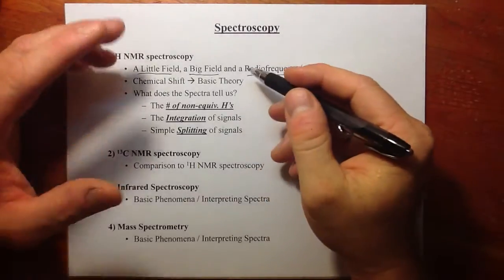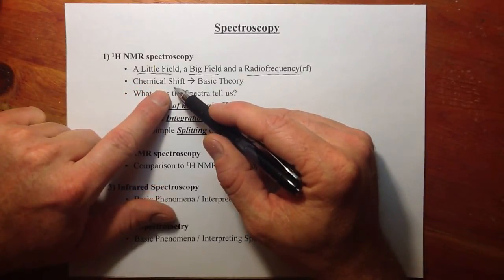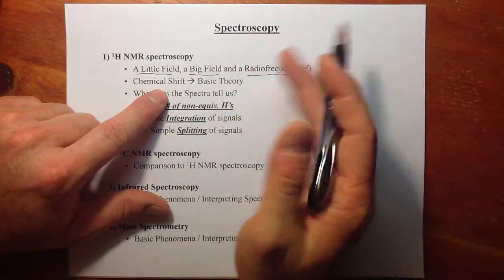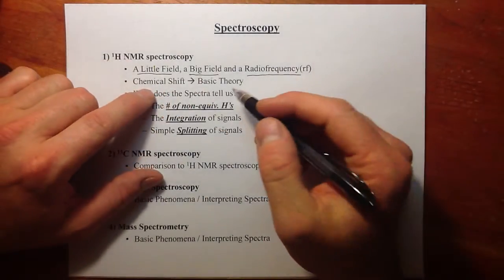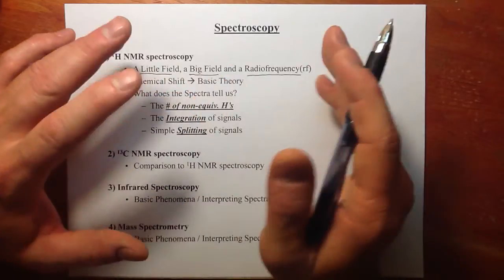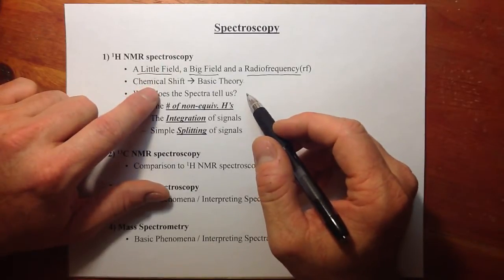And I'd also like to finish this intro on NMR spectroscopy by looking at the basic principle of how we can capture the chemical shift of certain protons in compounds, how we can separate those chemical shifts on some x-axis and look at the spectra, and the details of that spectra, what we can see from the spectra of a compound. So just a little bit more than the introduction to the 3 players in the drama. We'll talk a little bit about the data.